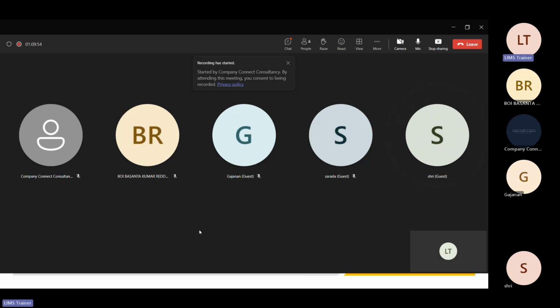See, my suggestion is, if you have some knowledge about the laboratory, you can go directly to administrative, no issue. You can do both. If you want end user knowledge with all details, you can do this course. See what your requirement is, that is important. But for knowledge purposes, I will recommend you go for both. Finish this course, and after some gap you can go for the administrative course.